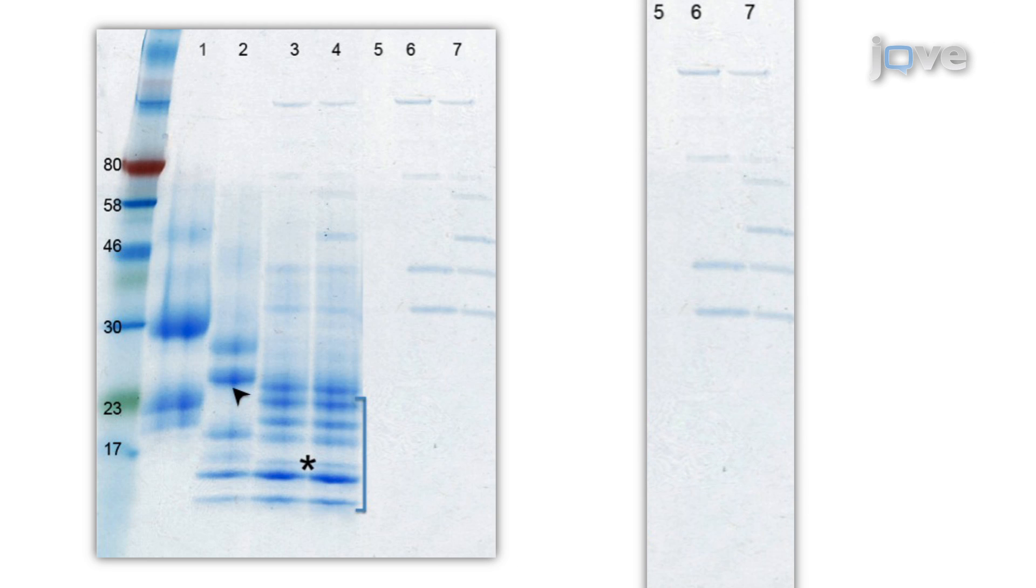Lanes 5 to 7 show the bands corresponding to the glycosidases. Other bands might derive from incomplete deglycosylation or from multiple unidentified proteins present in the HCG-beta sample.